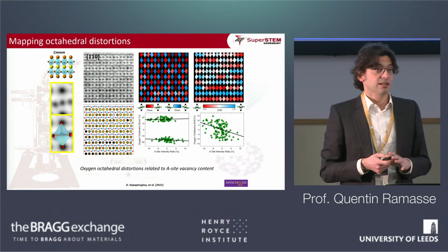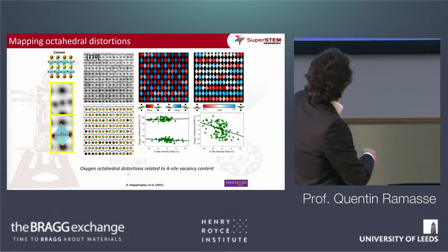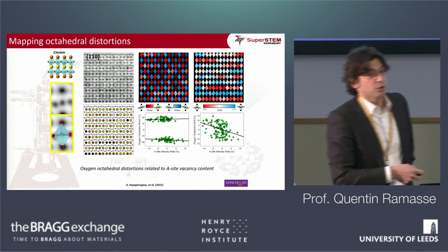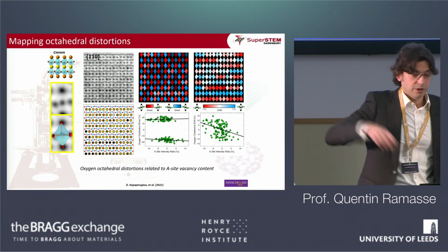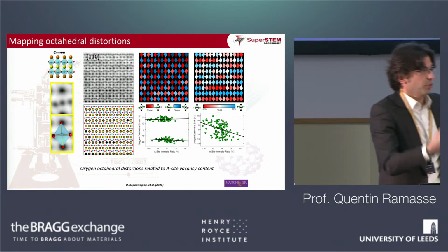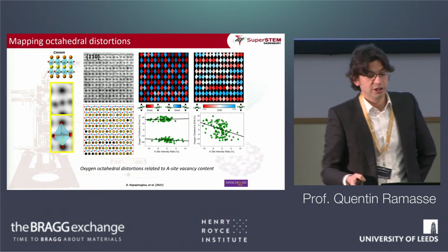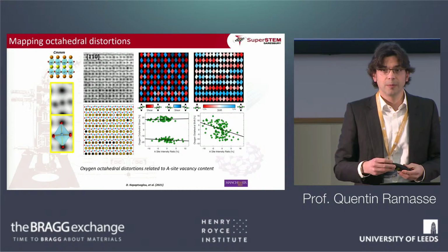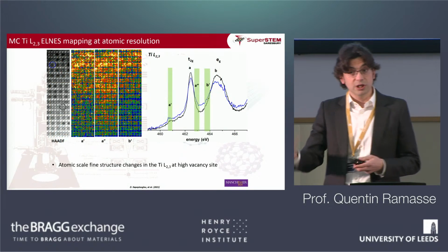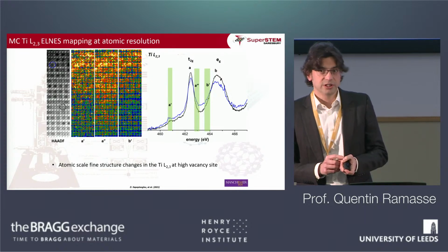And seeing that at the atomic level, you can do it in a quantitative fashion, measuring small distortions of the order of tens of picometers, maybe picometer level at the atomic level, and then correlating that with the intensity of the columns, and therefore perhaps with what you might call concentration. Of course, it's perhaps slightly better to do this using spectroscopy rather than just images and contrast, and actually look at electron energy loss spectroscopy that I was telling you about earlier.